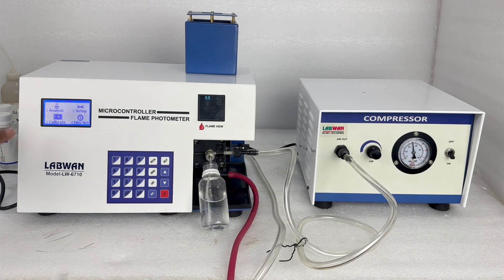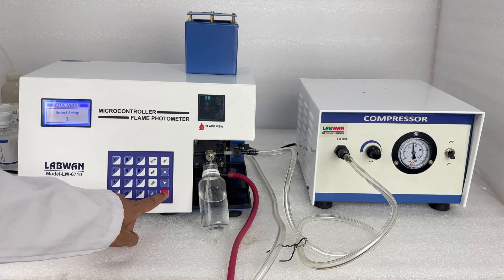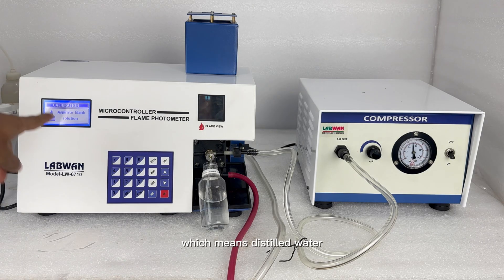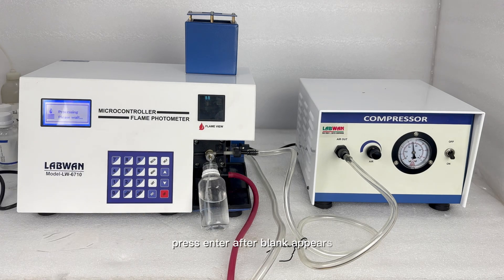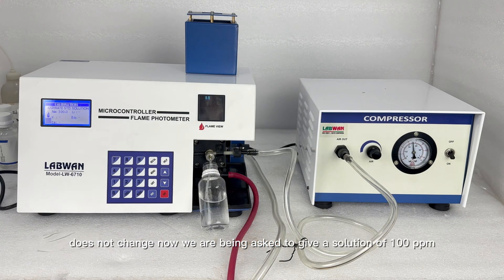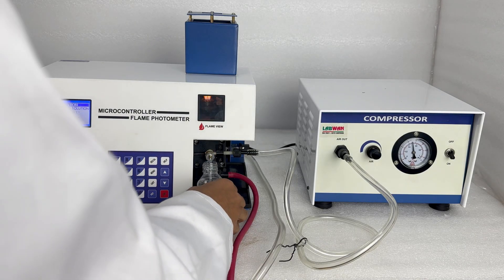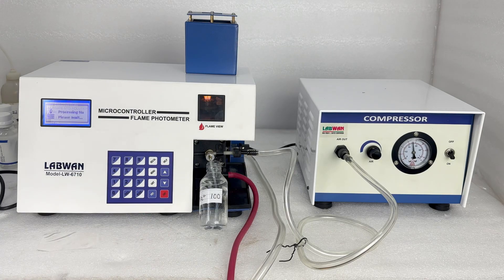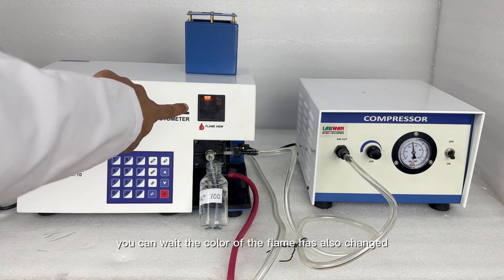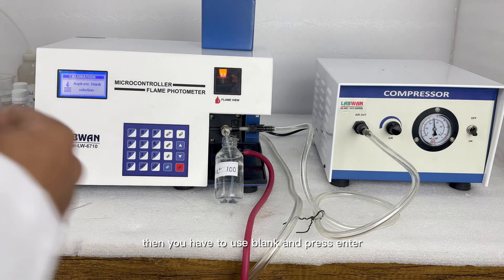Now we have to do calibration. Press 3 for calibration. We have saved the setup — select 1 for sodium. I have saved sodium in setup 1, press enter. Now we are told to use blank, which means distilled water — press enter after blank appears. Take care that the value on the compressor meter does not change. Now use a 100 ppm solution and press enter. Wait — the color of the flame has also changed. Then use blank and press enter.